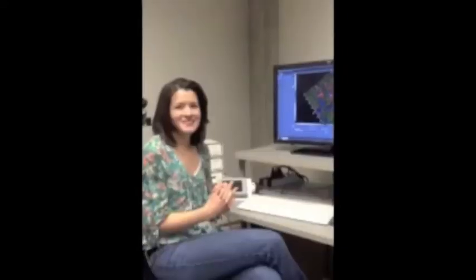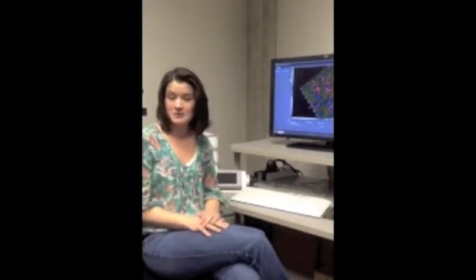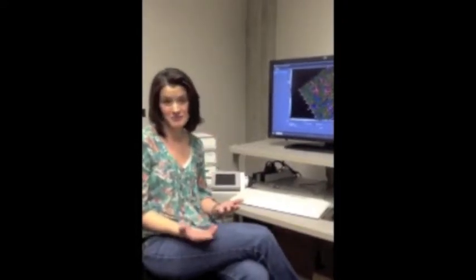So the tissue that we're looking at here is from a rat brain, and specifically we're focused on the prefrontal cortex, which is an area that's associated with higher order processing. So it's where a lot of decision making is done, where the rat's sense of smell comes from as well, which we know is a huge communication piece.